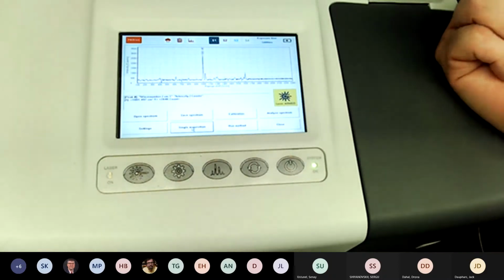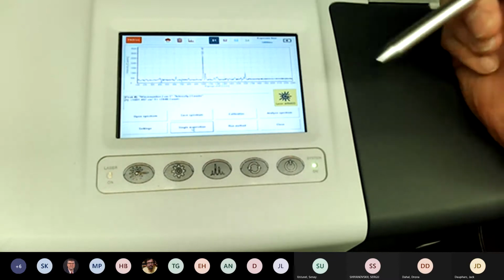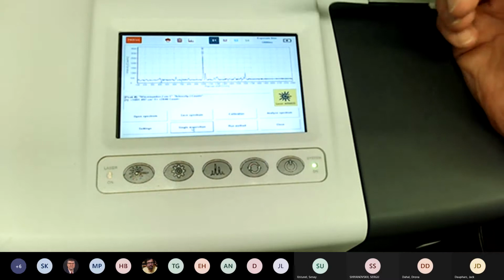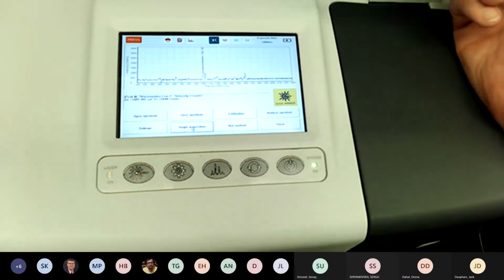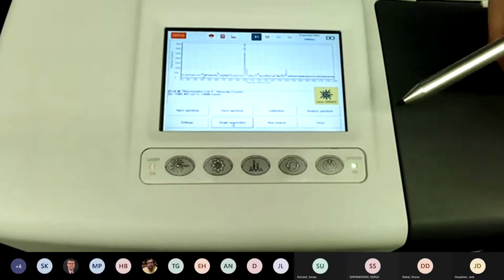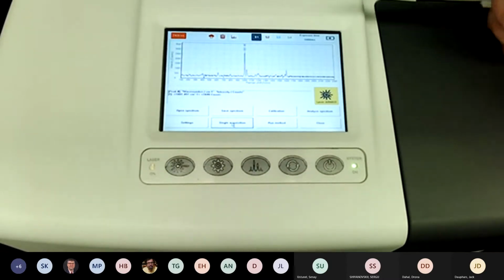So this polystyrene is used as a daily verification standard. You run it, it verifies it, it'll say verification passed. So that is a known, and it is in the library. Once we run something, if we are looking for an unknown, we do have a built-in library. You can see the compounds. I'll let you look through that as you need to.